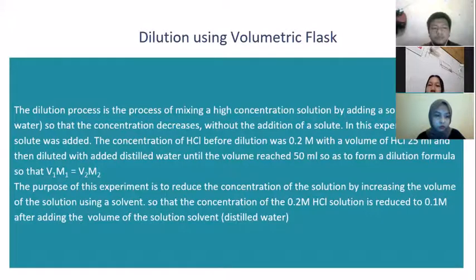The purpose of the experiment is to reduce the concentration of the solution by increasing the volume using a solvent, so that the concentration of the 0.2 molar hydrogen chloride solution is reduced to 0.1 molar after adding the volume of solvent or distilled water.